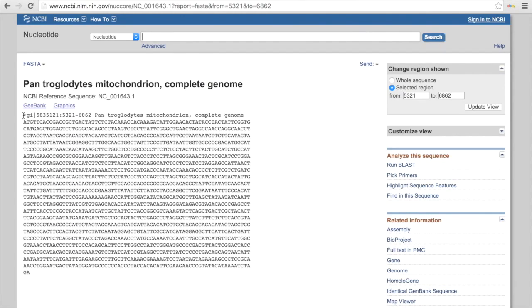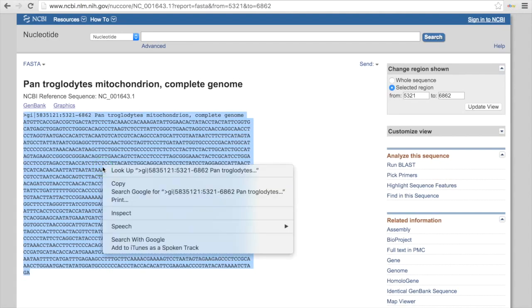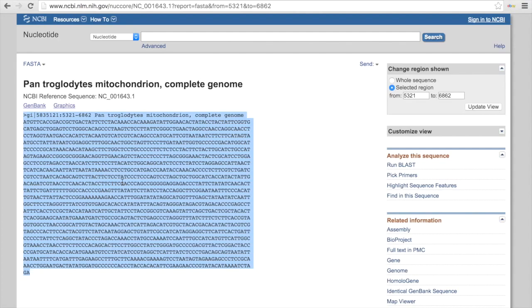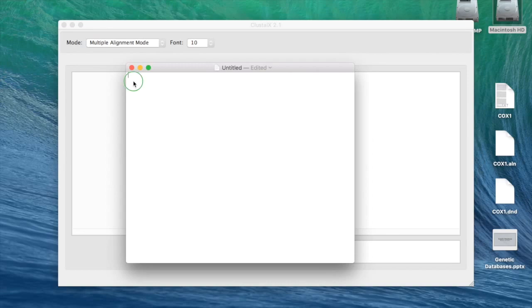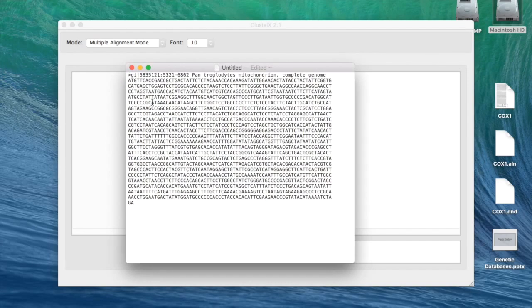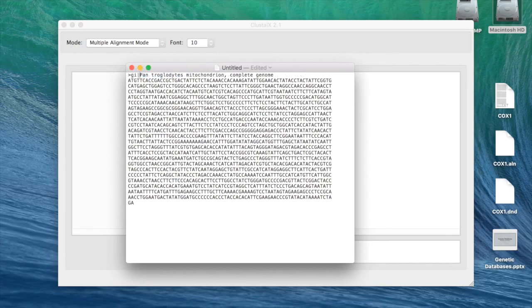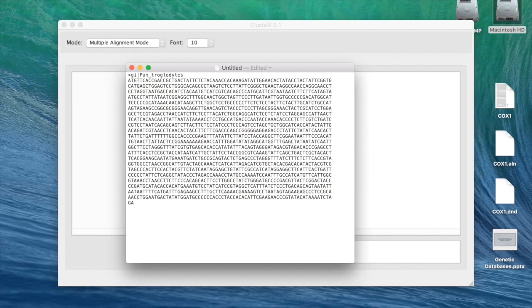We need to copy all of this, so I'm going to just highlight all the information there, including the header at the top. I'm just going to press copy. Now, take that and we're going to paste that into our text file. Just to tidy things up a little bit, I'm going to delete the number here. I'm going to put an underscore between Pan and troglodytes, and then delete this information. It'll just make the display of our information in the ClustalX program a little bit neater.